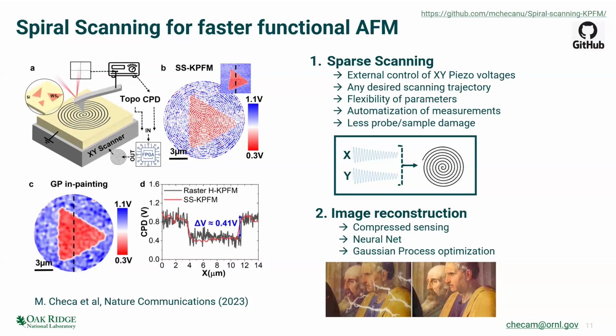It's actually a little better for the piezos themselves because the piezos don't like to change directions drastically, and that's one of the things that takes more time during AFM scanning. So it's better for the piezos to just go around it like this. It allows them to scan faster, but it's also probably better for them long term. All the artifacts are induced more by how you do this reconstruction, not so much by the scanning path, if that makes sense. You can have different reconstructions. You can have a look at them, this is discussed in my GitHub. If you want. Mauricio?